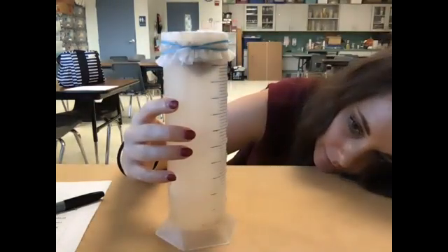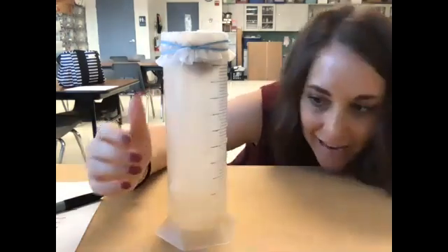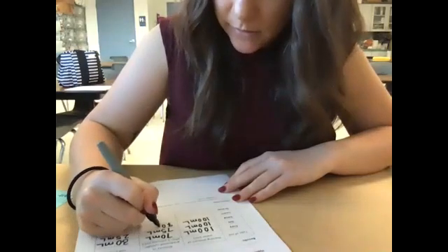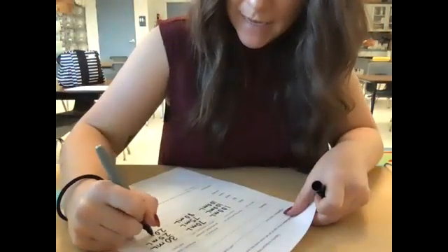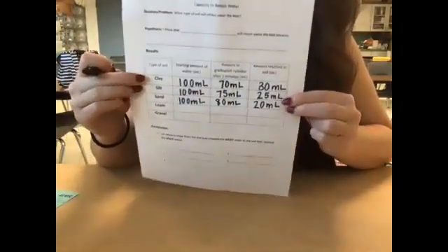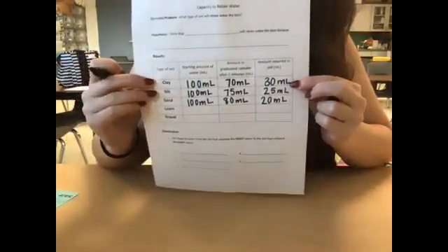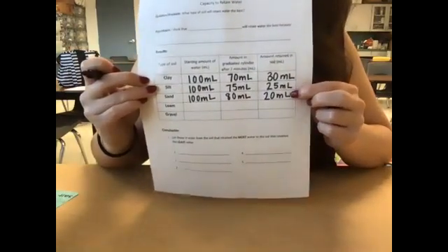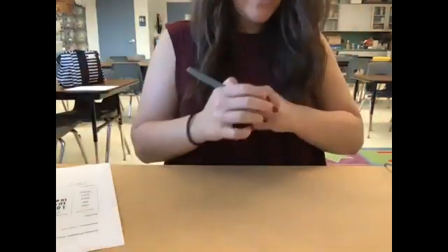In my graduated cylinder, I have 80 milliliters. So I started with 100. In my graduated cylinder after 2 minutes, I have 80. 100 minus 80 is 20. So that means my sand is holding in 20 milliliters. So far we have clay holding in the most at 30 milliliters, then silt holding in 25, and sand holding in 20. Next is our loam.